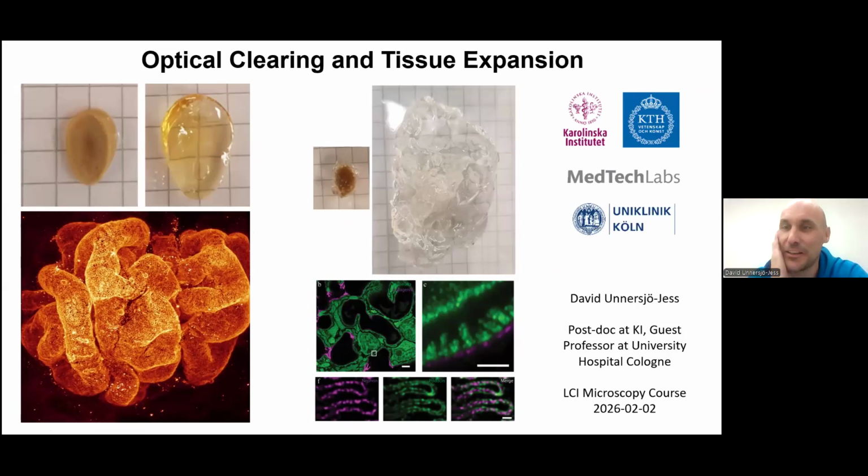So I'm a postdoc at Karolinska, but I'm a guest professor now at the University of Cologne. So that's my current status. I'm going to give this overview of tissue clearing, or optical clearing, and tissue expansion. As you will see in the presentation, these protocols are related to each other chemically, so that's why it makes sense to present them together.